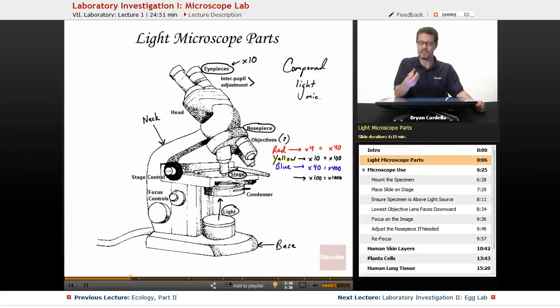When you're focusing, later on this lesson, I'll give you instructions about how to specifically use these parts. When the focus controls are being used, you start with this. This is called the coarse focus. The big one is the coarse focus and this one is the fine focus. So you move the coarse focus first. That's when it actually moves the stage up and down. So while you're looking through the eyepiece, you move the stage up and down until it becomes clear. Then you can make it even extra crisp by moving that fine focus. The condenser, I haven't really mentioned what that actually does. You can adjust how much light is actually going through the condenser and into the stage region. So those are the major parts of the light microscope.